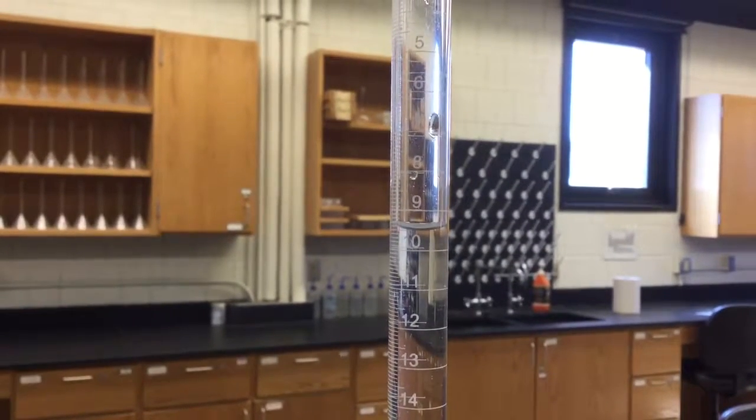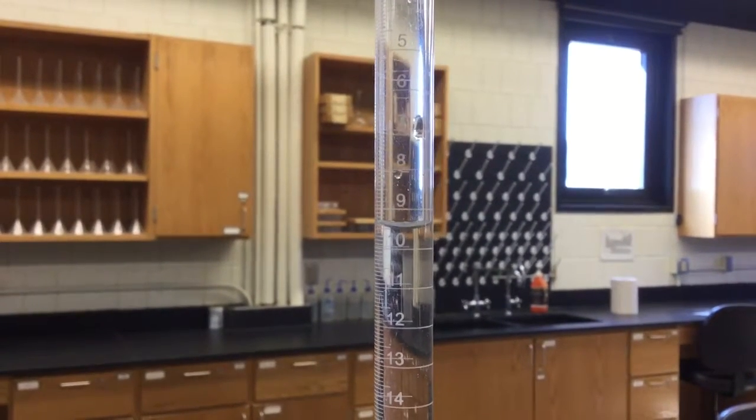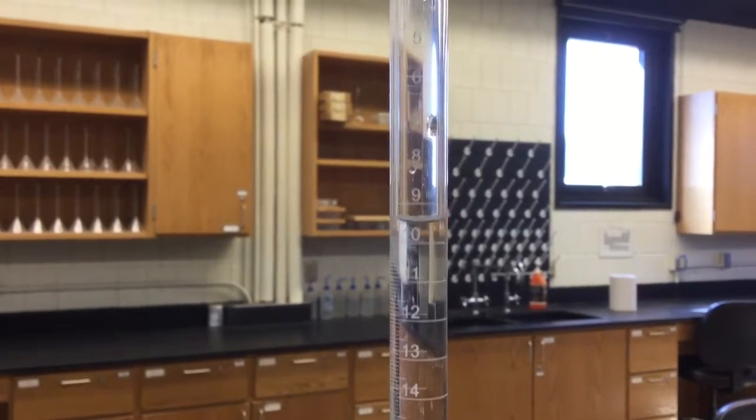Okay guys, since I had poor time management skills during class today, you were unable to see the titration portion of the lab. So this is my attempt at making a video to demonstrate it.